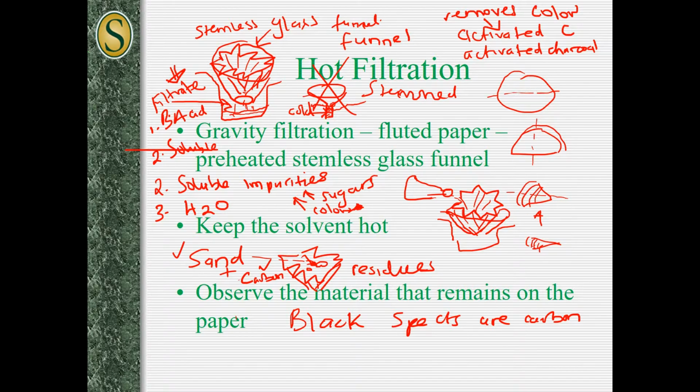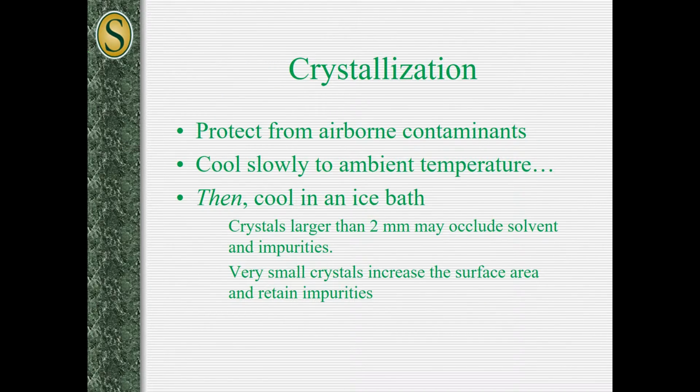So the next step is going to be to cool it down. When you're done, we will cover our beaker containing our filtrate, which has only benzoic acid and water.